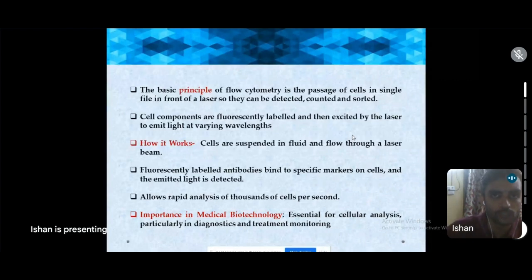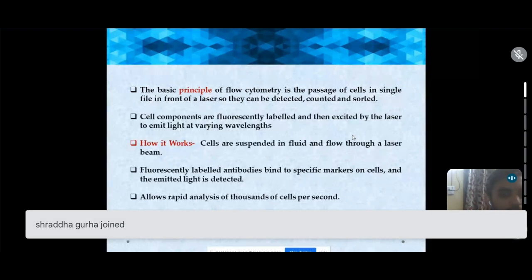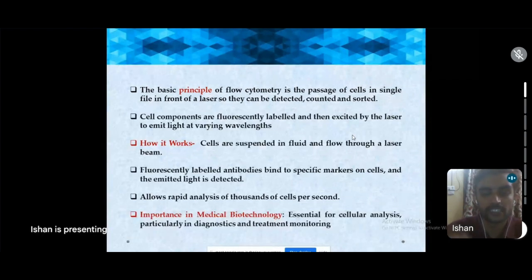These receptors bind to different kinds of antibodies, drugs, and pathogens. This binding makes the cell activated or may elicit a response from the cell. When this interaction happens with a fluorescently labeled antibody, the fluorophore attached to the antibody fluoresces, and it is recorded on the system.